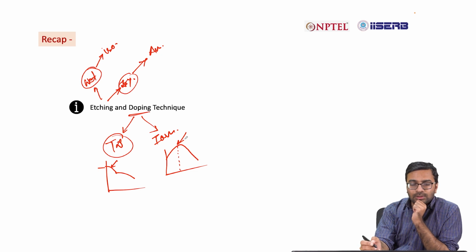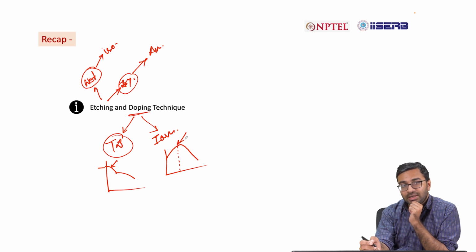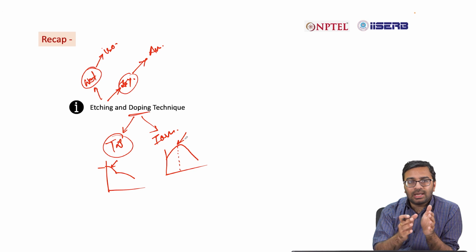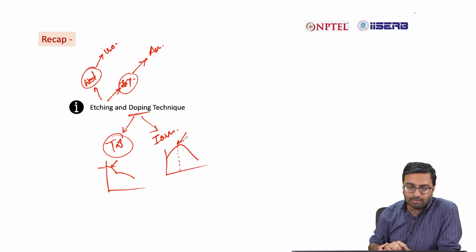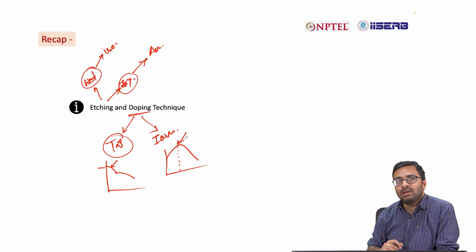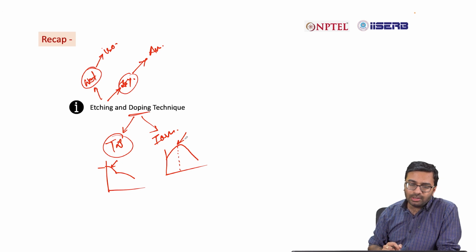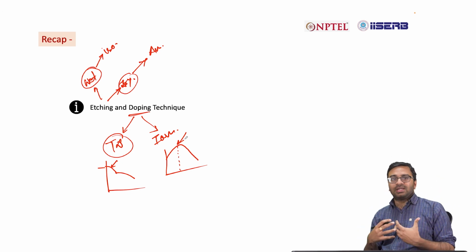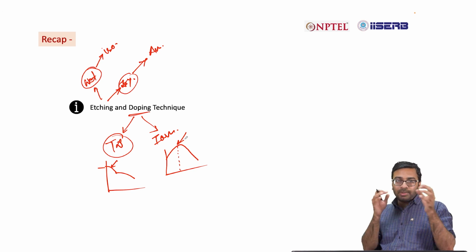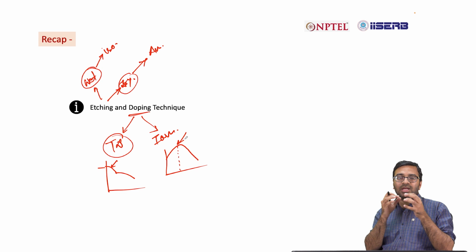Now today we will also check what are the imaging techniques available in order to characterize different devices. So we already have discussed what are the characterization processes involved in microfabrication or sensor fabrication or device fabrication, and imaging technique is one of the most important ones. Why is it most important? Because most of the devices or sensors require a certain sort of geometry. Now once you start fabricating those geometries, you need to visualize or check whether you achieved that geometry or not.